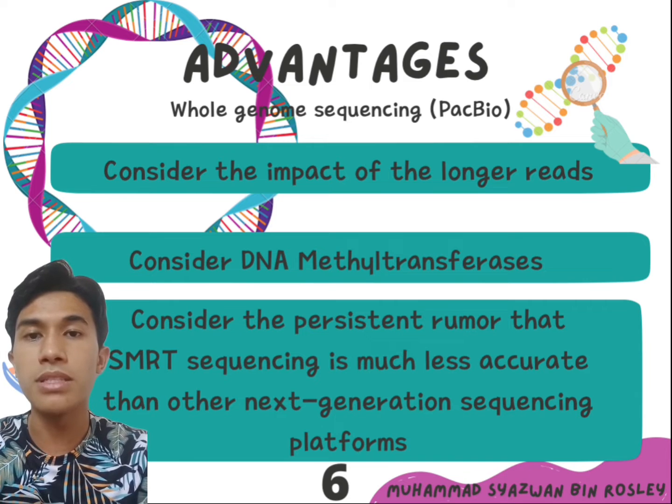Resolving fragmented assemblies necessitates more time at the bench and more sequencing. The read set will span many more repeats and missing bases as a result of including the longer reads from SMRT sequencing runs, automatically bridging many of the gaps and reducing the completion time.